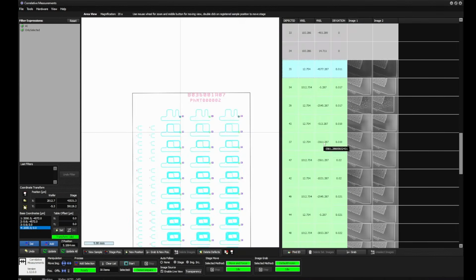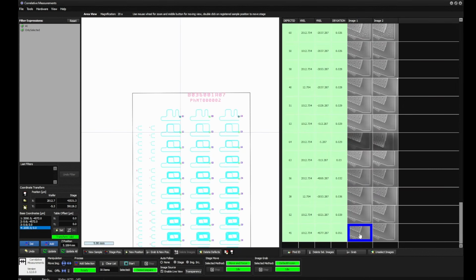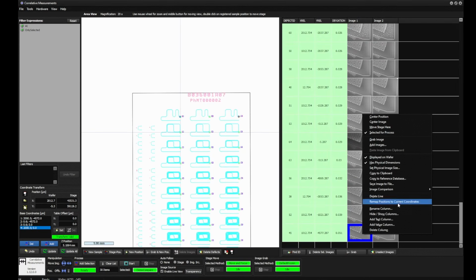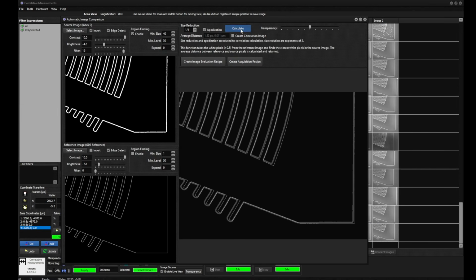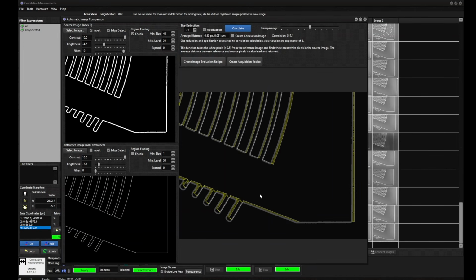And let's check the counterpart on the worst. The worst calculation. Yeah. Okay, you can see here the images overlap here at this part quite good, but this, for example, here, there we have a quite strong deviation.